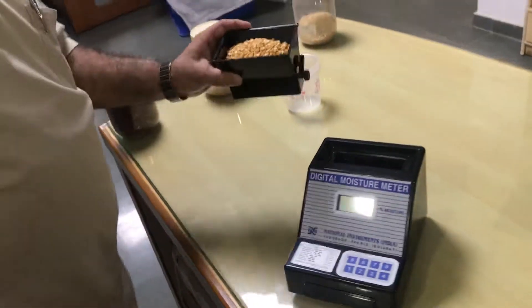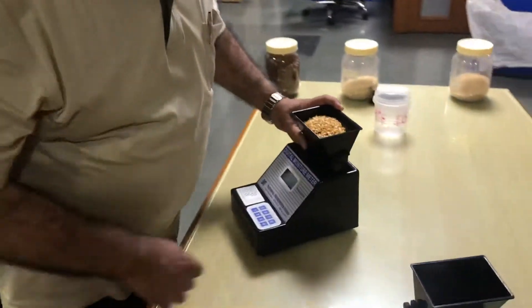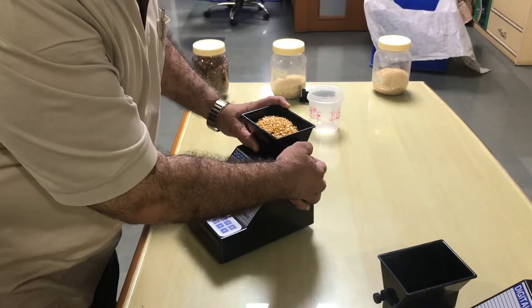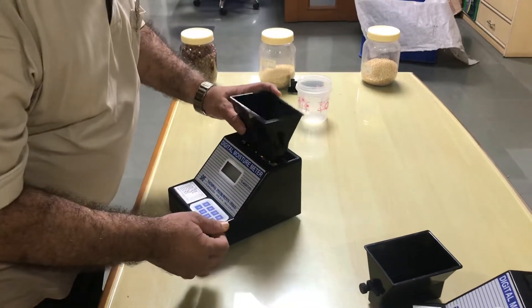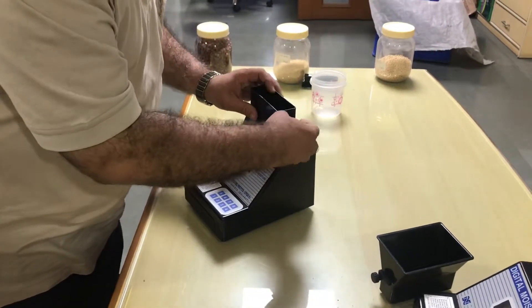We have taken 150 grams of toor dha in this particular hopper. Now we are placing this hopper on the meter so that the lever comes on the right side of the instrument. By putting the lever down, the whole sample of toor dha falls inside this instrument.